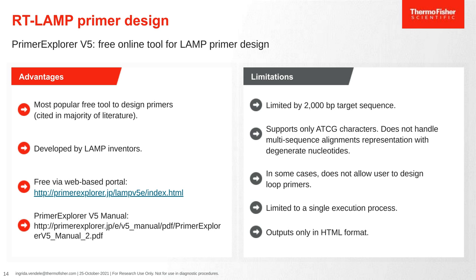Here I'd like to present an online tool for LAMP primer design, which is the most popular free tool to design primers since it's cited in the majority of literature. It's called Primer Explorer. It has been developed by the LAMP inventors, and the link is provided here on the slide. It has a very descriptive, informative user guide and manual, which provides a lot of useful information on how to design successful primer sets. It has some limitations.